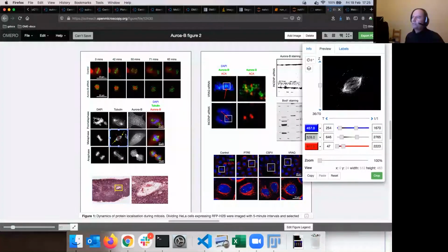Then you can do regions of interest in the figure. And I actually remember now I should have shown that. I will come back to it because you should see that and should be able to do that. You can draw new regions of interest inside OMERO.figure, but you can also fetch regions of interest from OMERO. And we will go through that in a second. Then you have various types of insets combined with arrows and differently positioned labels. That's all what OMERO.figure can do.